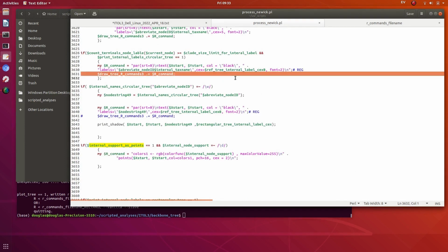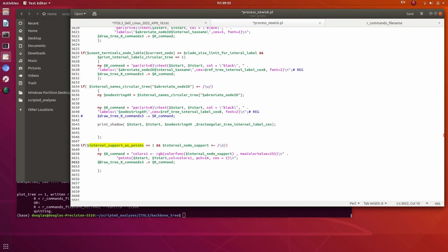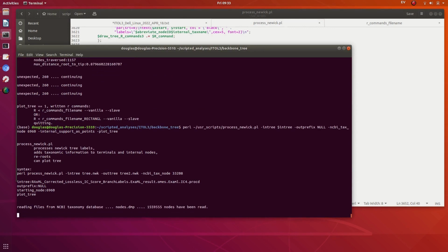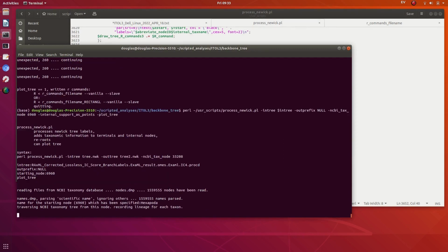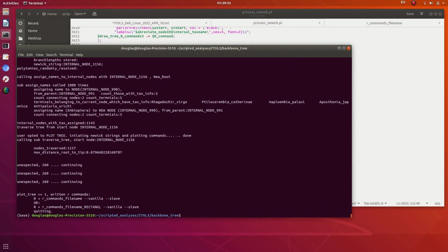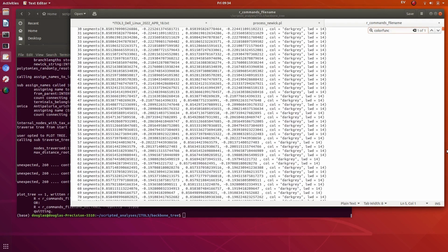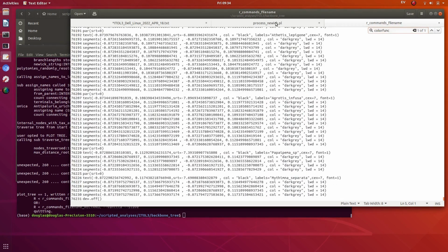So I need to add this. Add this here. Try again. Still don't see it.